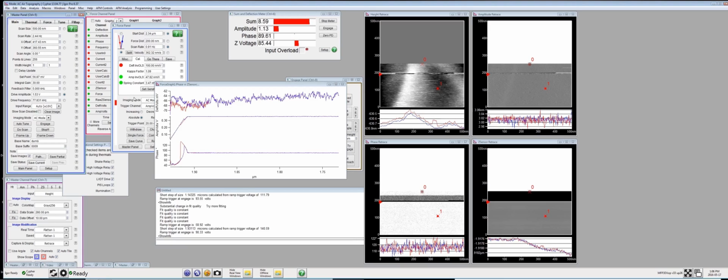1 volt should be 40 something nanometers, so 1.5 is still much less than 200. So say 1.5. This should be okay. At this point we should be very careful and not press single force. If we do that, because the amplitude is so large, when the tip goes to the 20 millivolts minimum, it will crash, so it will be damaged.